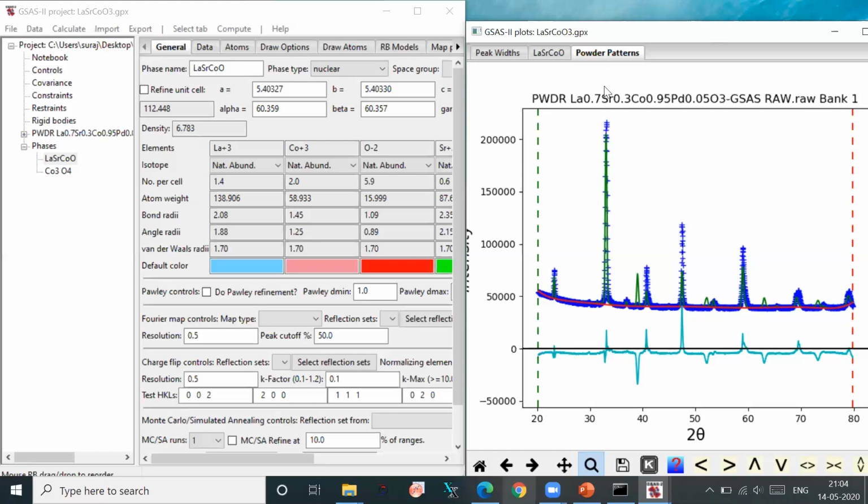So it is plane-dependent growth, meaning it is growing along a particular plane. That's why it is giving maximum intensity at some place, or the maximum differs between the standard and your experimental pattern. Yes, the 100% intensity peak is present. Others are not. But the other peaks, that is fine. For that you can refine it, no problem.